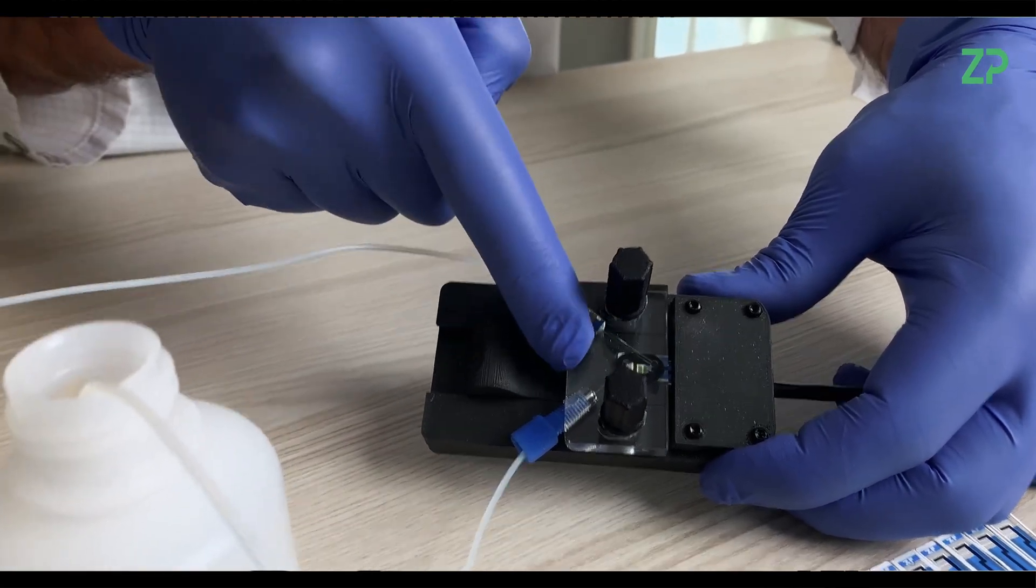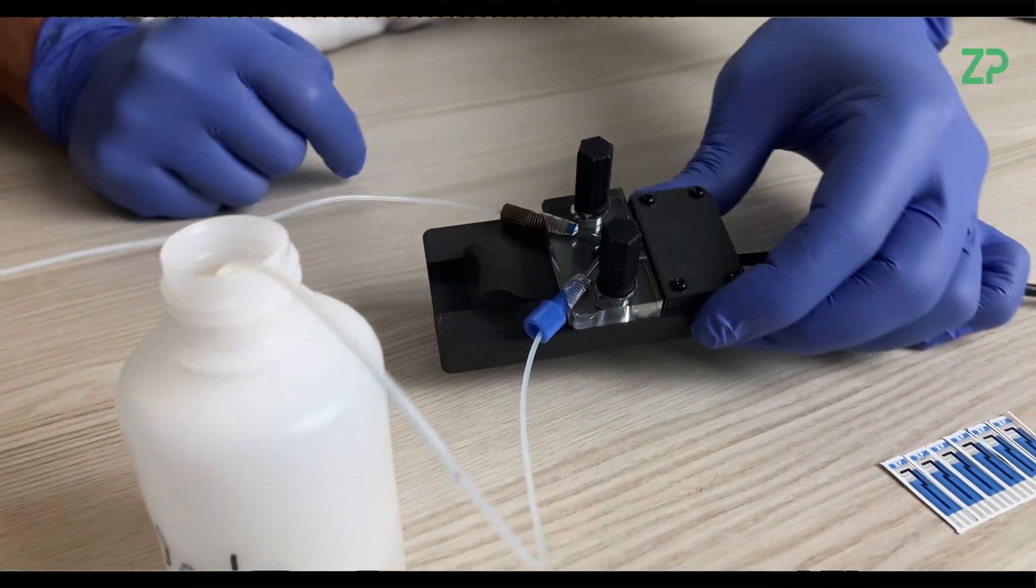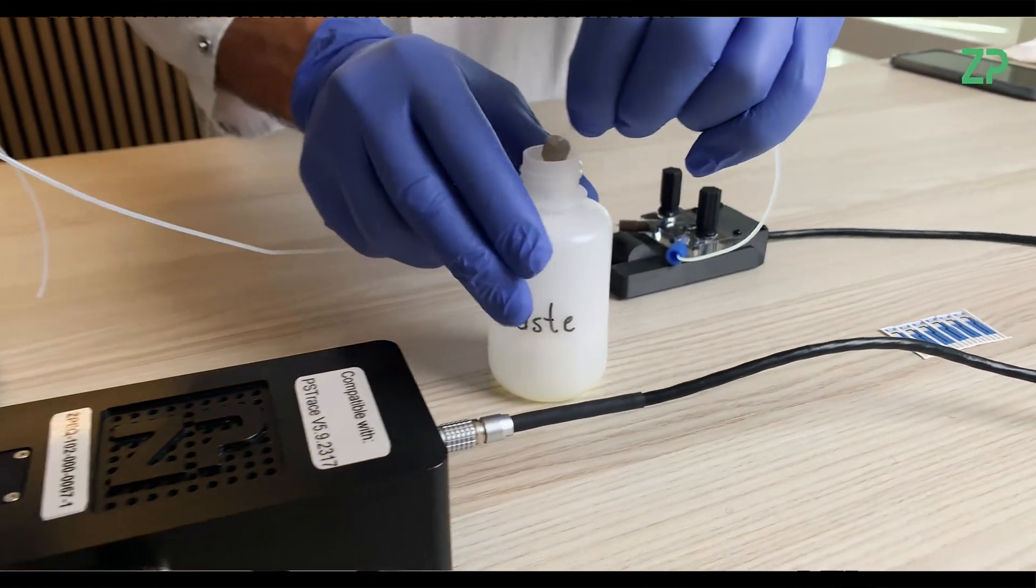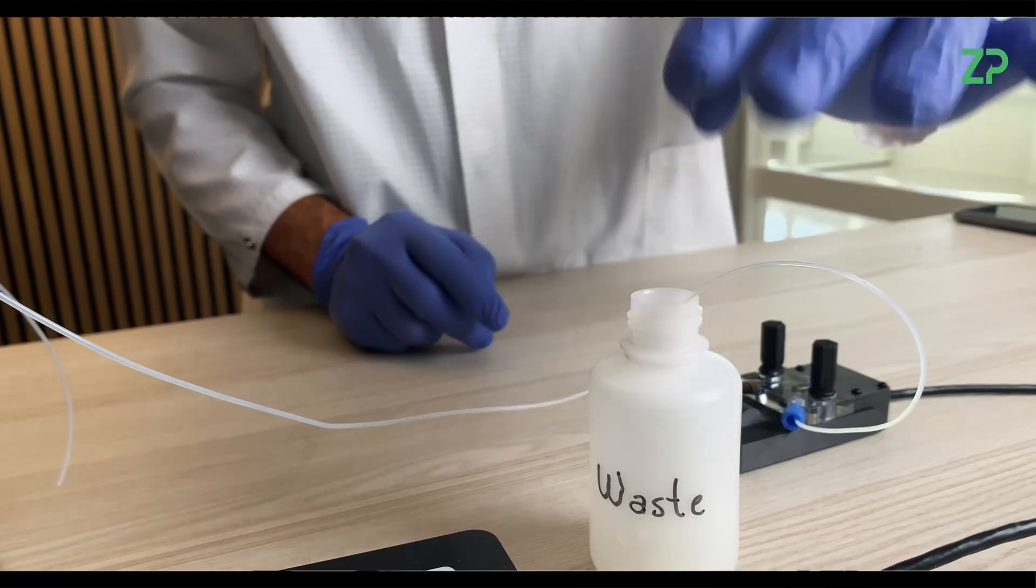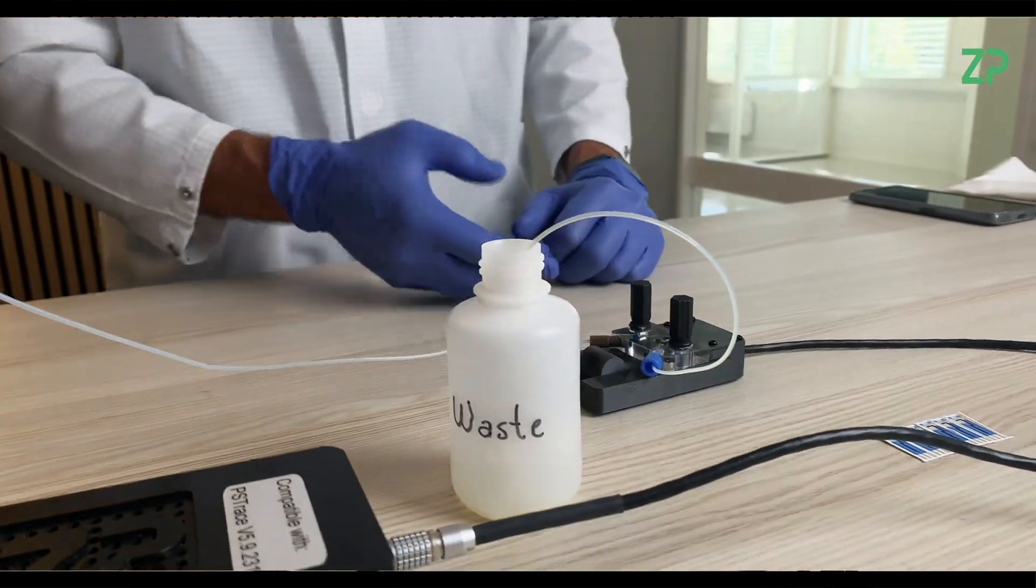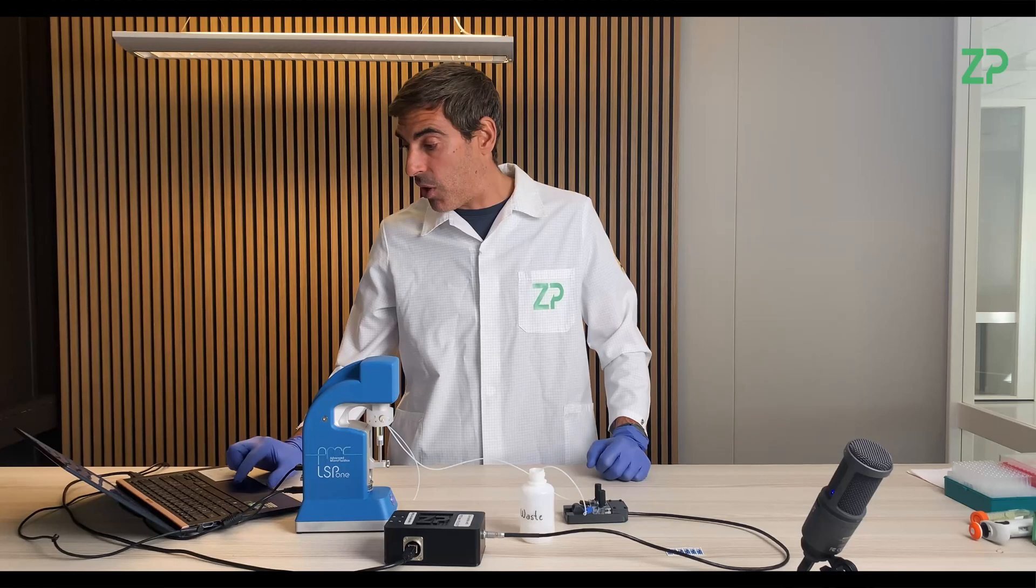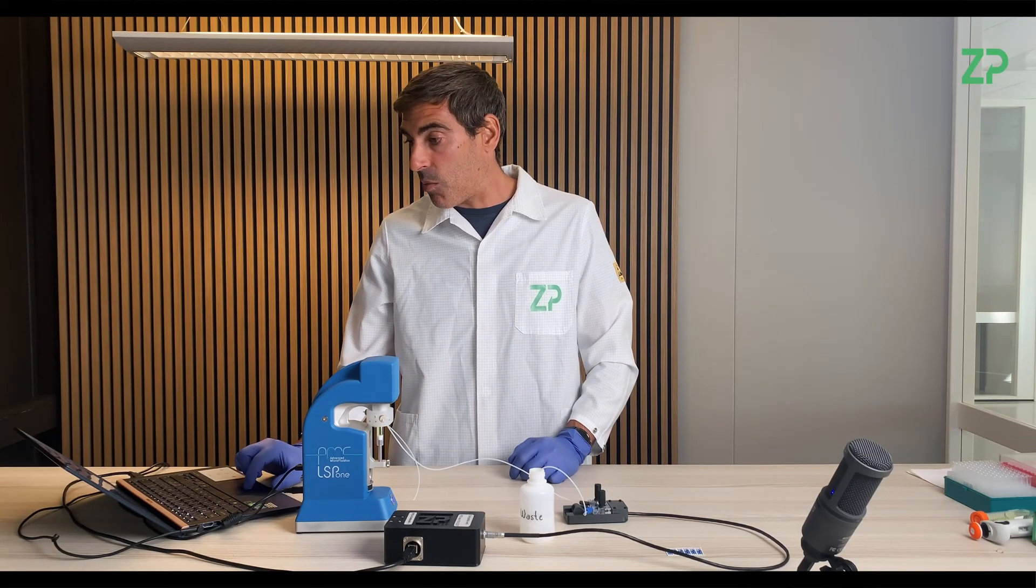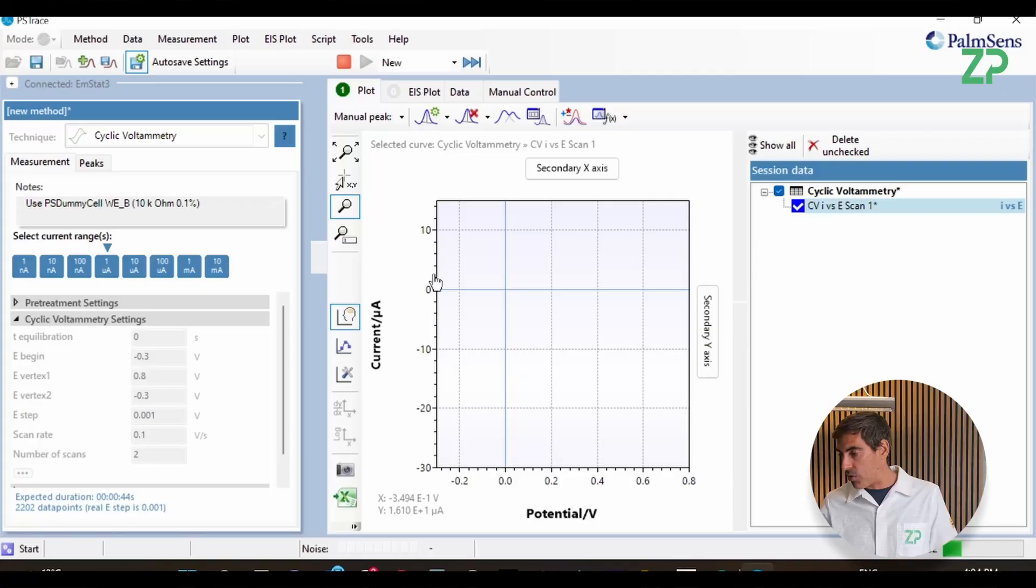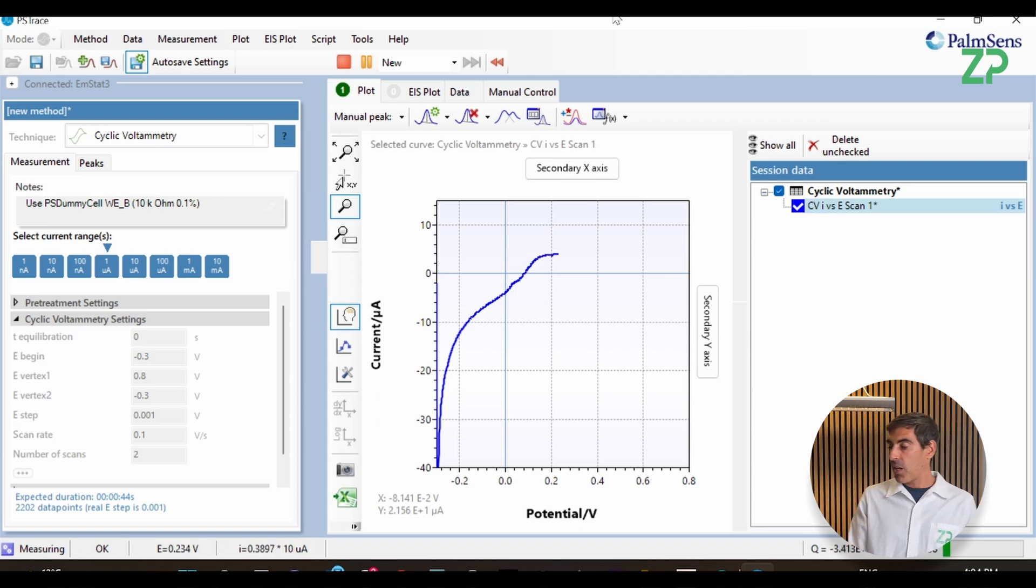And I see no leakages, so it's good. And it's probably already arriving to this side. Yeah, you can also already see drops. So we have here a continuous test setup. And now since it's connected to the Anapod, I am going to the software and I'm going to run a cyclic voltammetry to see if I identify those redox peaks. So now that's what we are looking at. I'll be doing two cycles.